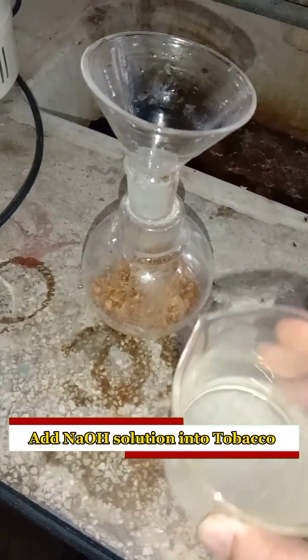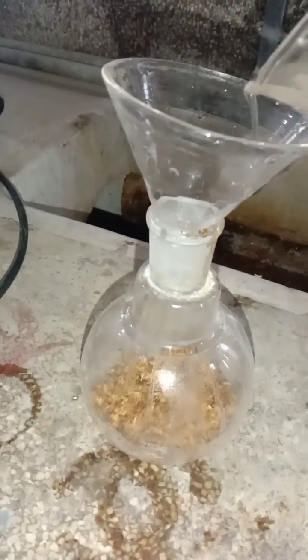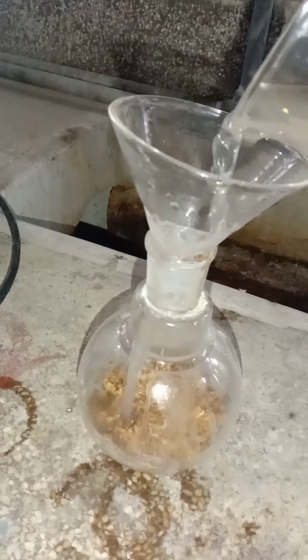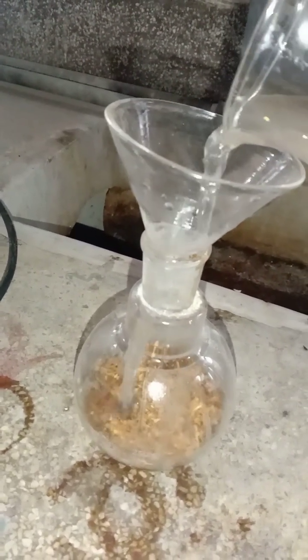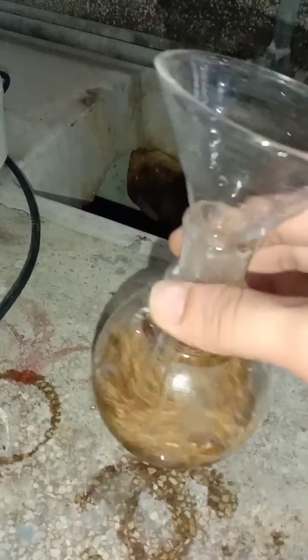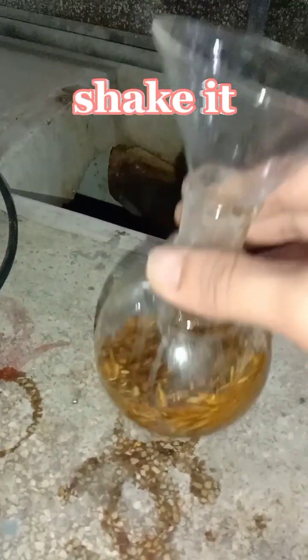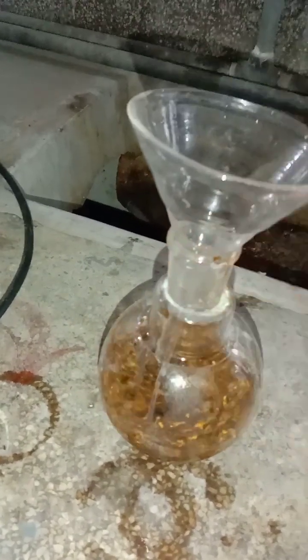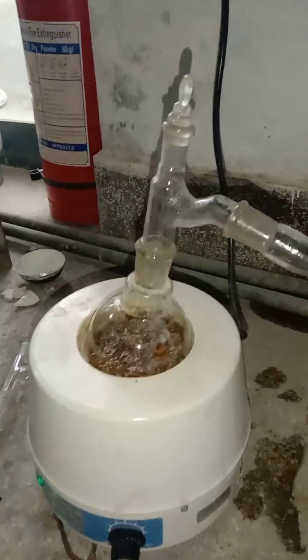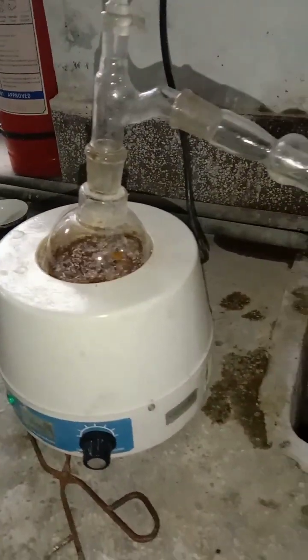Now we take tobacco out from cigarettes and add the sodium hydroxide solution into the tobacco. We pour the sodium hydroxide solution into a round bottom flask which contains the tobacco, then shake the round bottom flask properly so the sodium hydroxide mixes in.